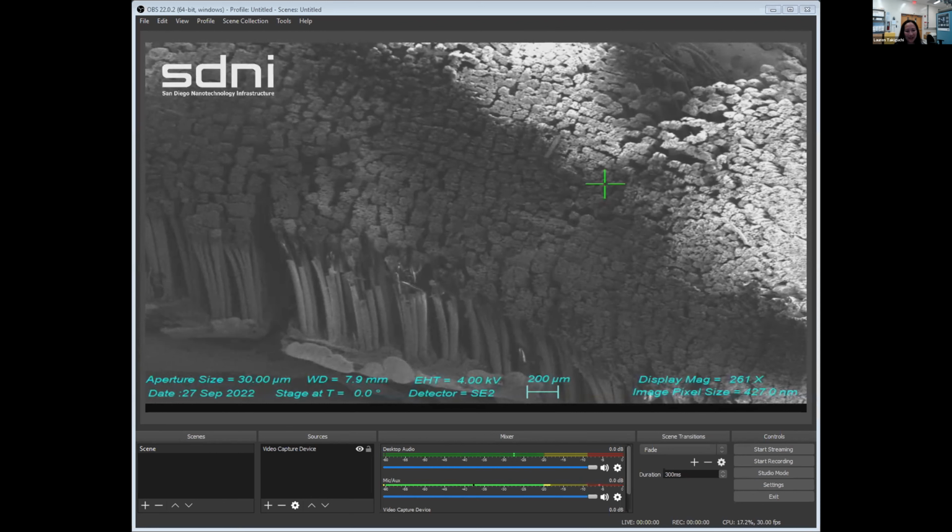But yeah, hopefully no animals were harmed in the sample making here. As you can see, there are some tiny structures going on here. Lots of stems with bundles of stuff. Those are called spatulae, because they kind of look like those baking spatulas that you cook with. And it turns out that geckos have hundreds of thousands of these.